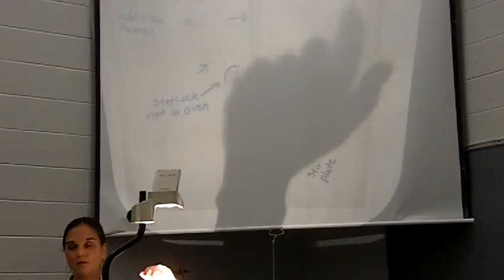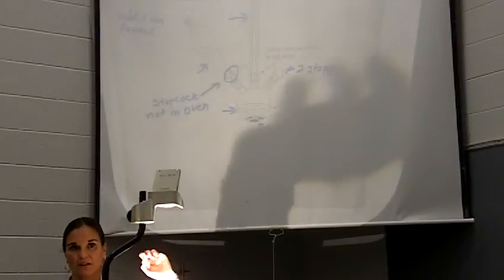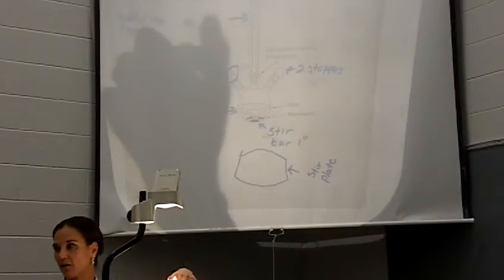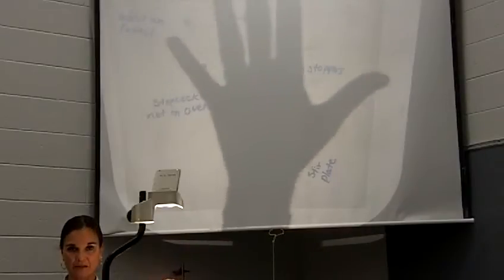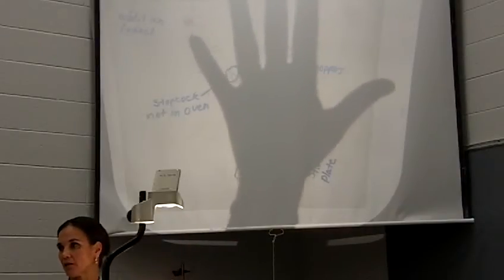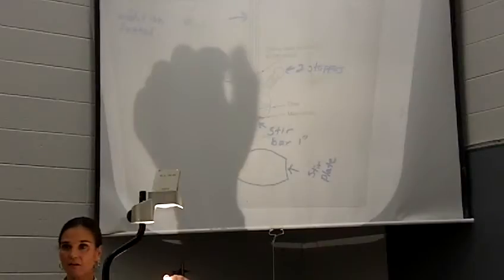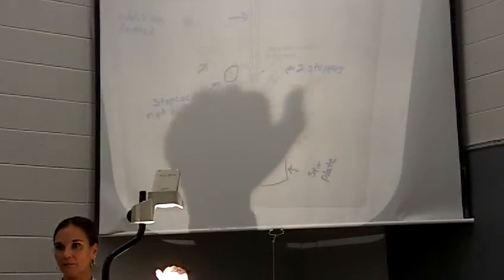So you don't want to try and get an Erlenmeyer flask out and make the solution or anything like that. We don't want to undo the dryness of the ether by trying to make the solution. Just add the ether first and then add your alkyl bromide. Then you've got your solution, okay? At this point, we are going to come around and check your setup, okay? And a lot of us will probably be adding that 5 ml portion from the sep funnel that your lab manual talks about. Will help you get the iodine in there and will help you get this reaction going, okay?